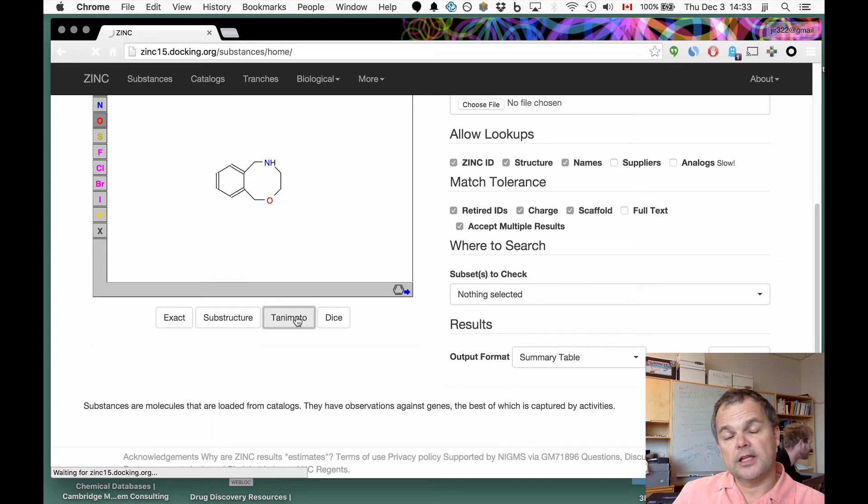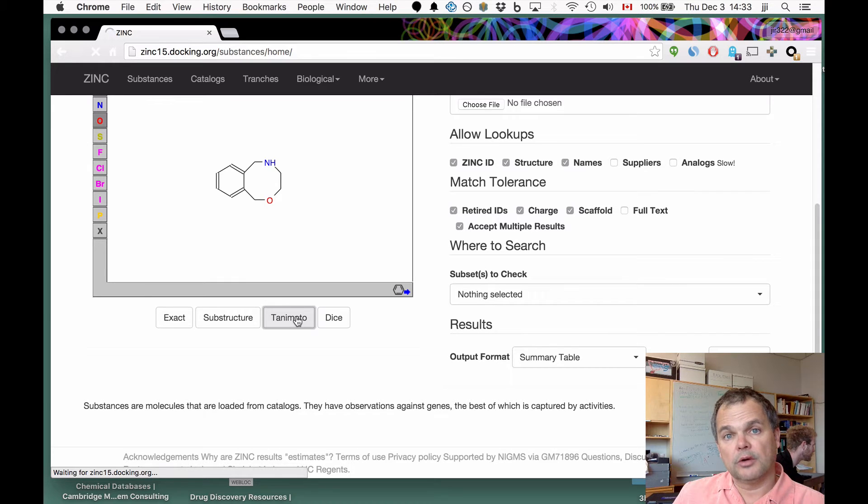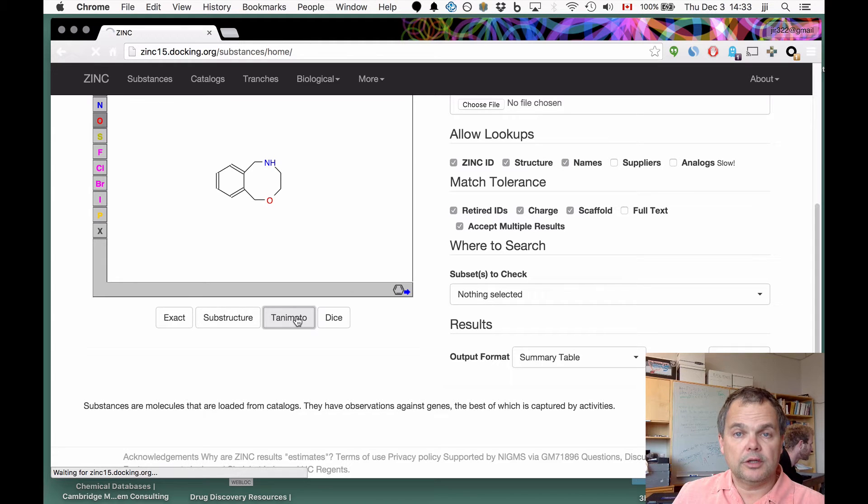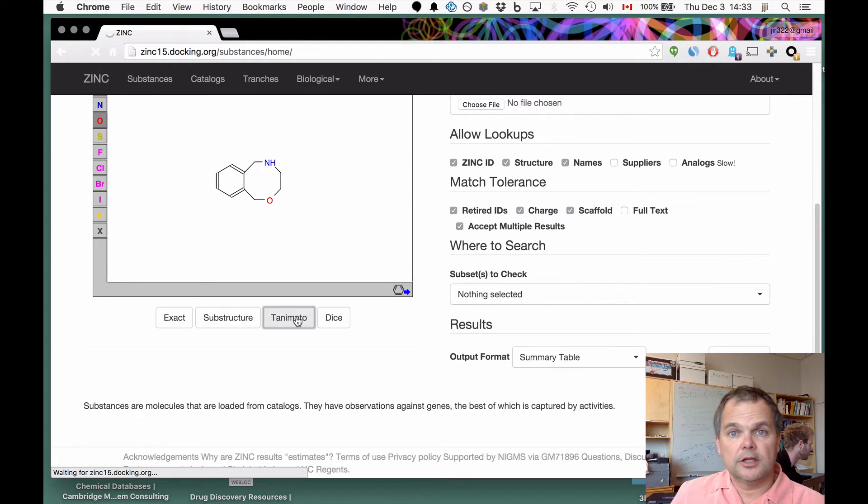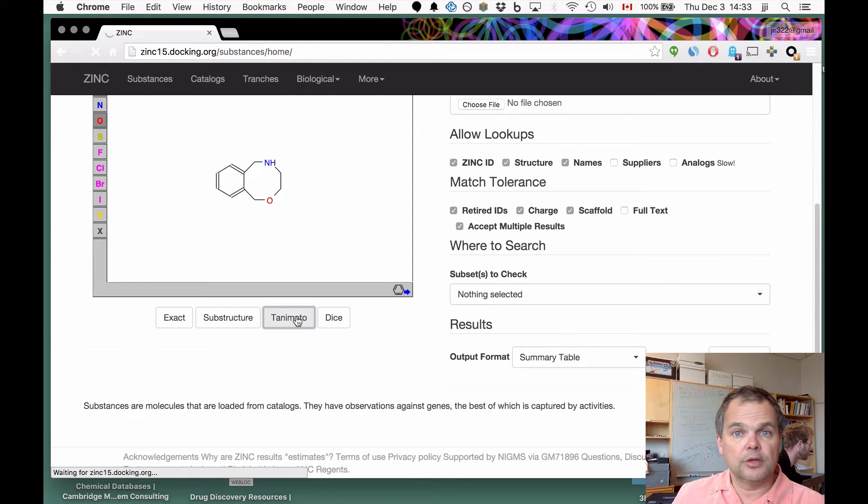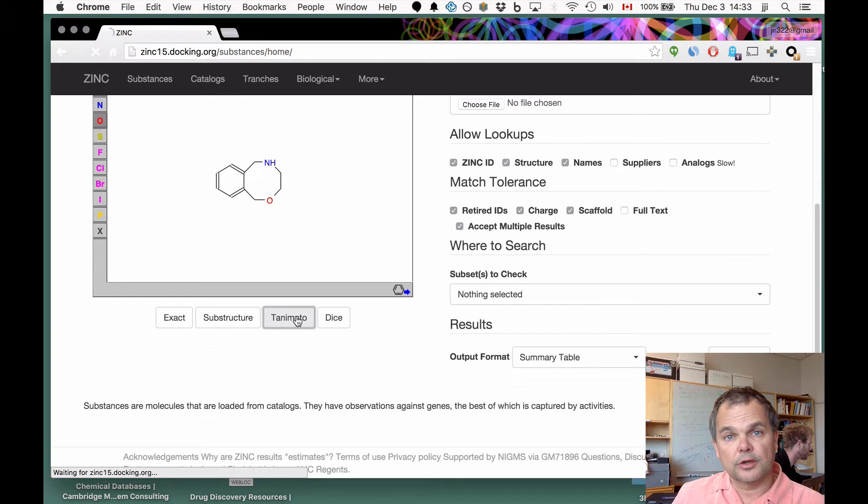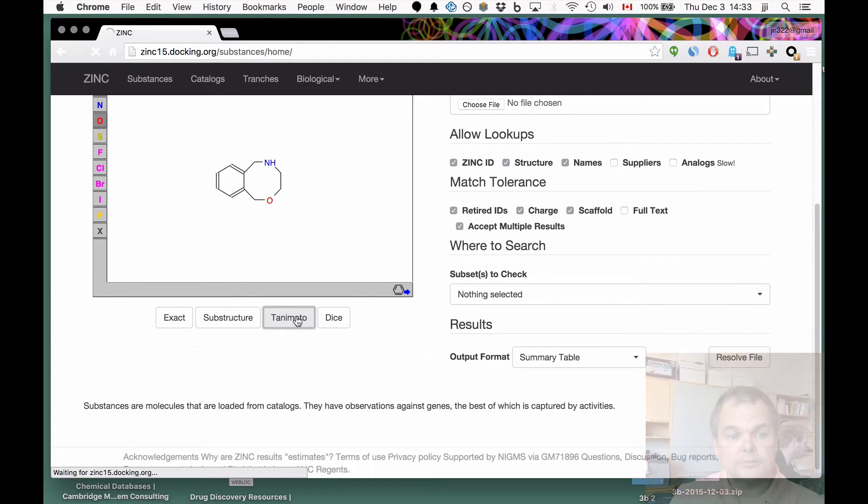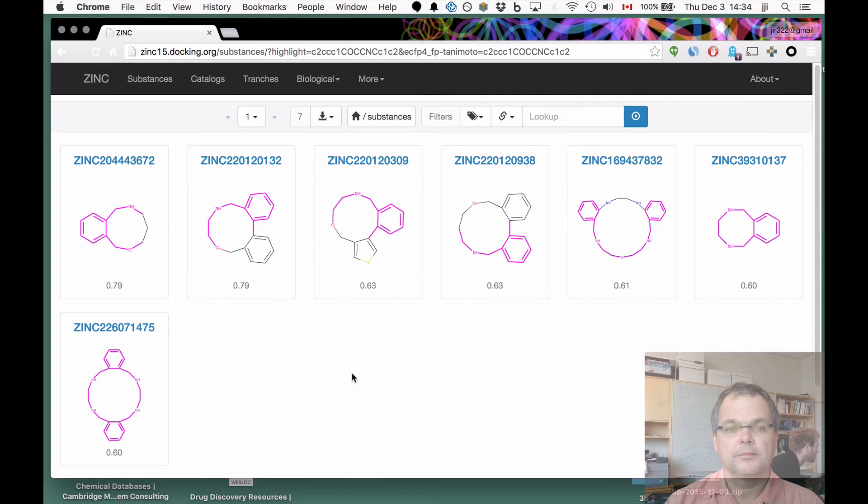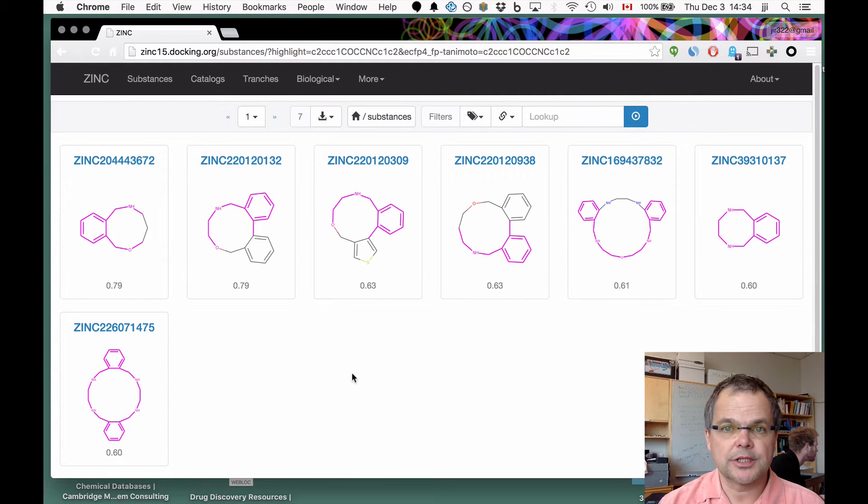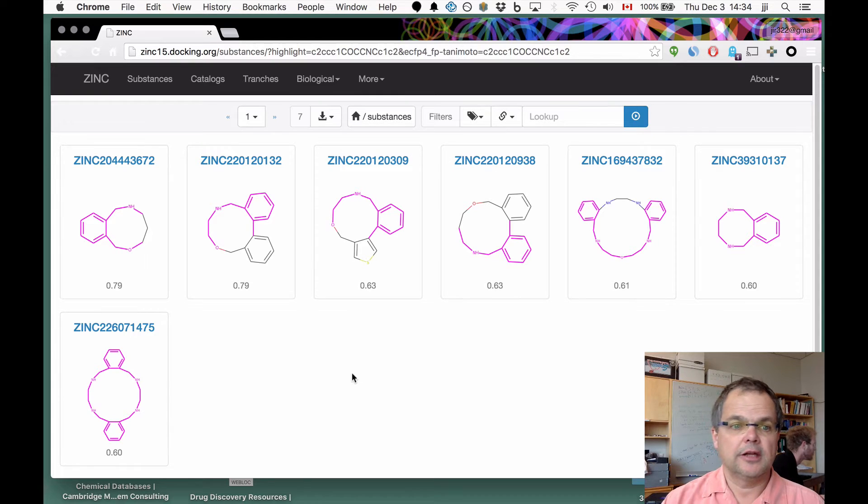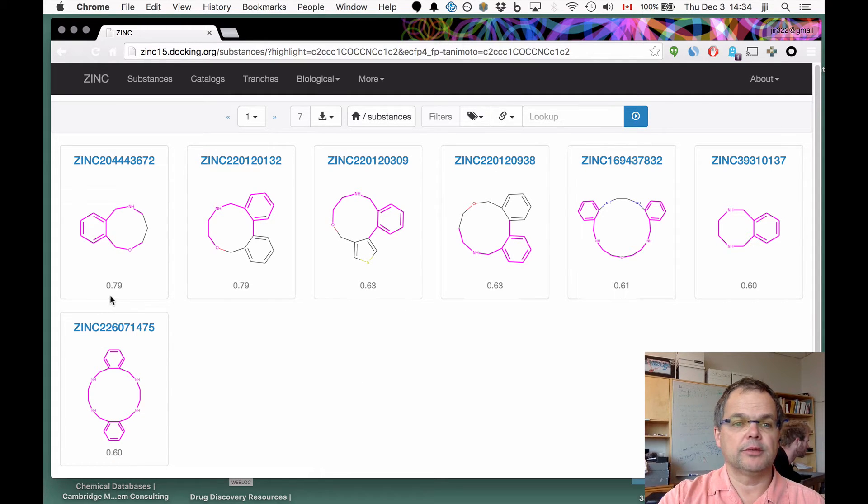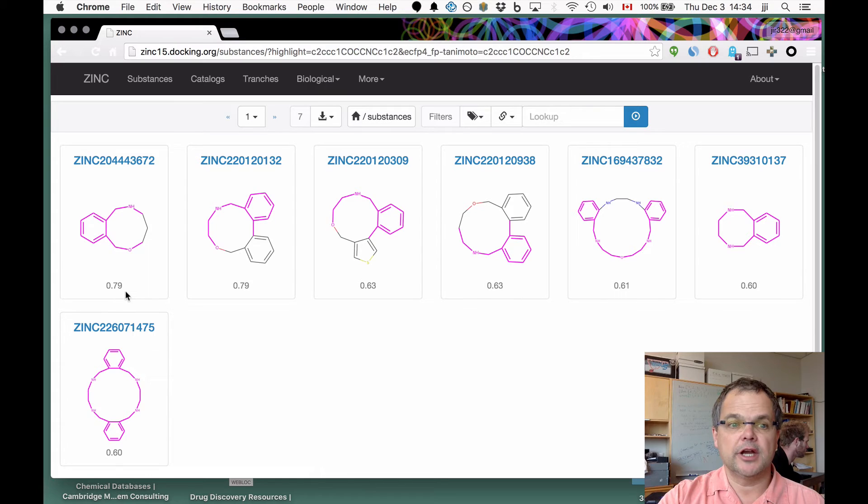We're now searching against 150 million or more fingerprints, ECFP4, Morgan radius two in RDKit parlance. That search is happening right now in real time. It's going to show us the molecules sorted in decreasing order of similarity with a Tanimoto coefficient for each similarity. Here's our search result, molecules are sorted in decreasing similarity.